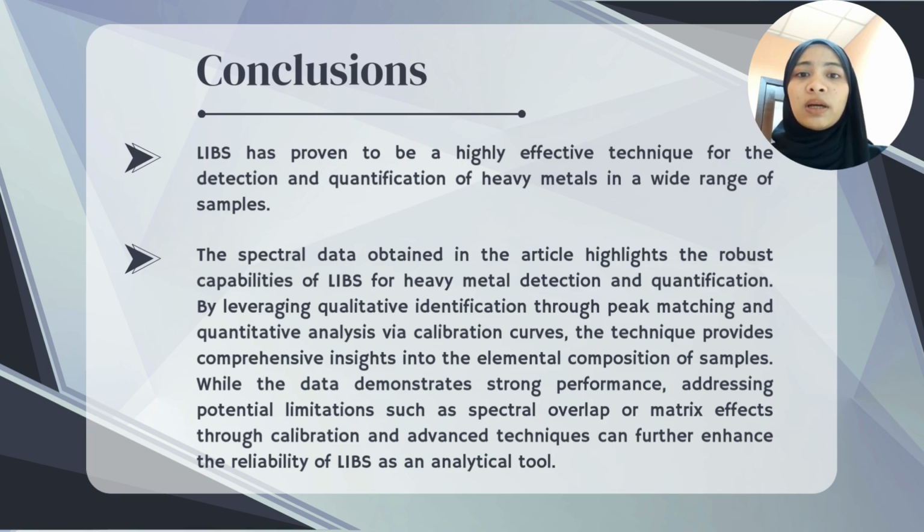By leveraging qualitative identification through peak matching and quantitative analysis via calibration curves, the technique provides comprehensive insight into the elemental composition of a sample. While the data demonstrates strong performance, addressing potential limitations such as spectral overlap or matrix effects through calibration and advanced techniques can further enhance the reliability of LIBS as an analytical tool.